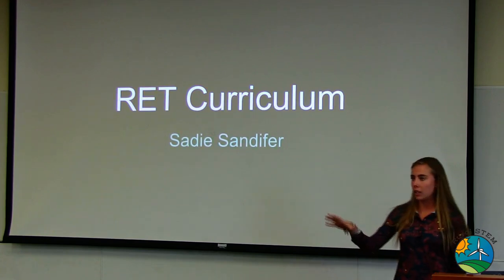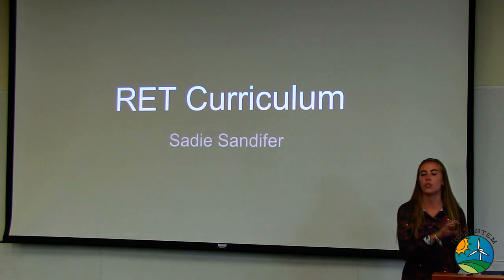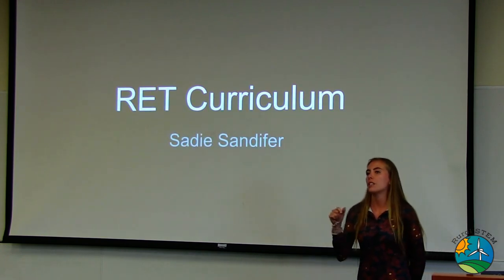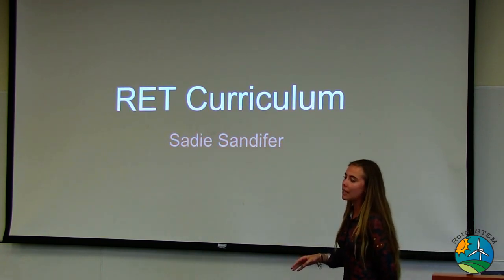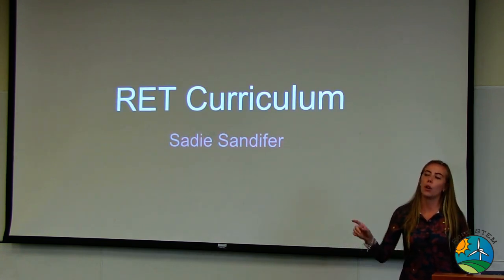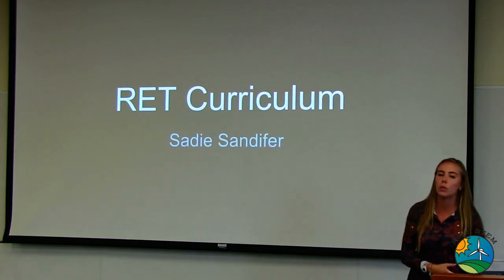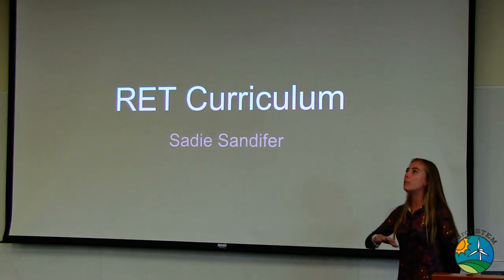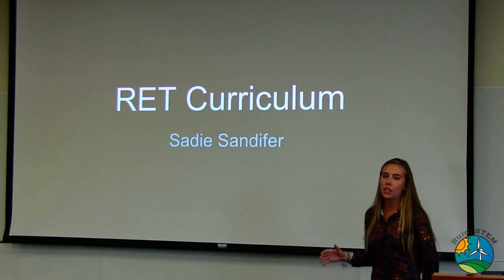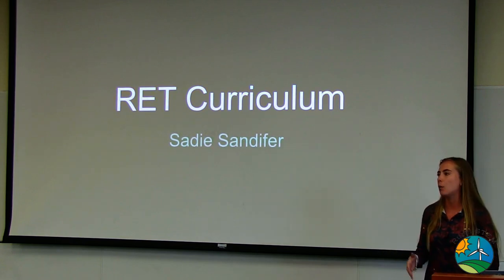My overarching curriculum goal is distillation, specifically with regards to oil refinement. It's going to take about 4 days to complete. Today's activity that we're going to do in-house is going to be a part of the engagement activity, so day one's activity. It's a very short, simple lab, but the bigger lab will be the distillation, and I just took a couple pictures of me conducting it because this lab will take upwards of an hour.